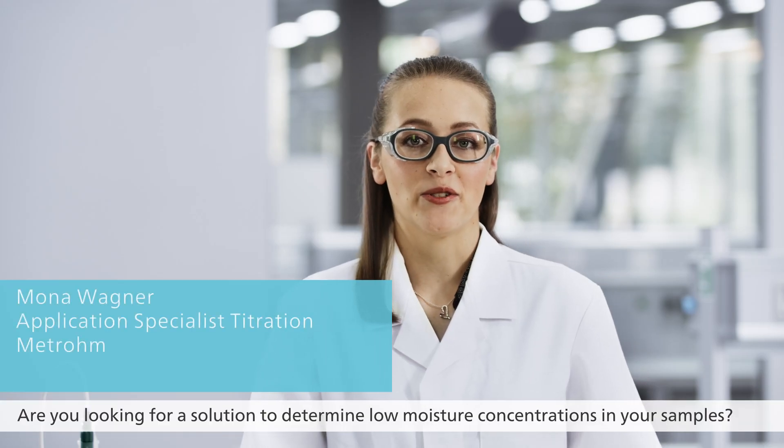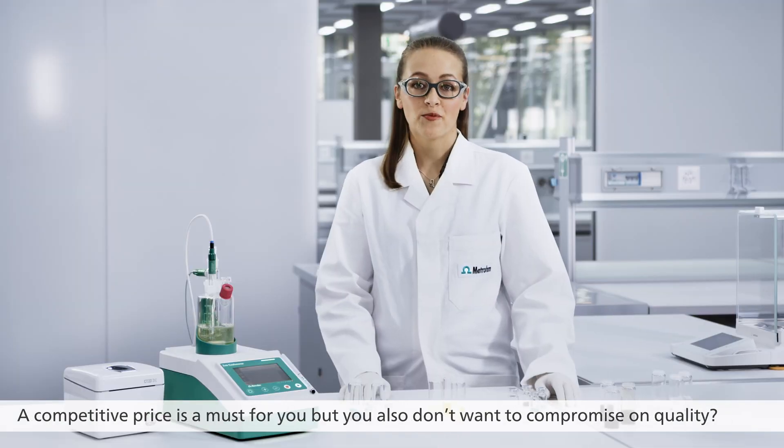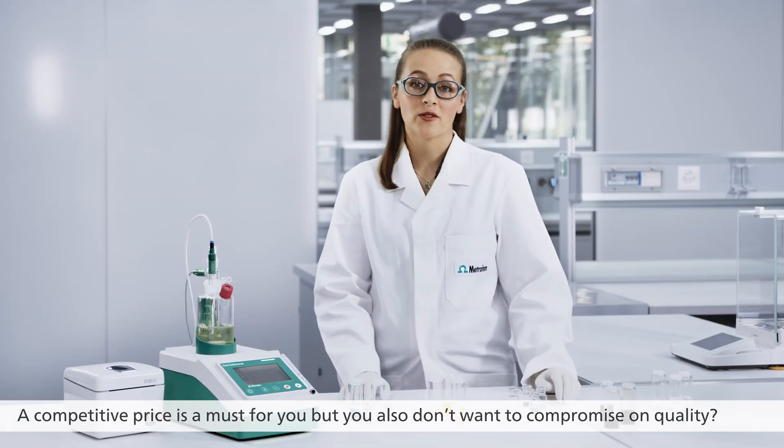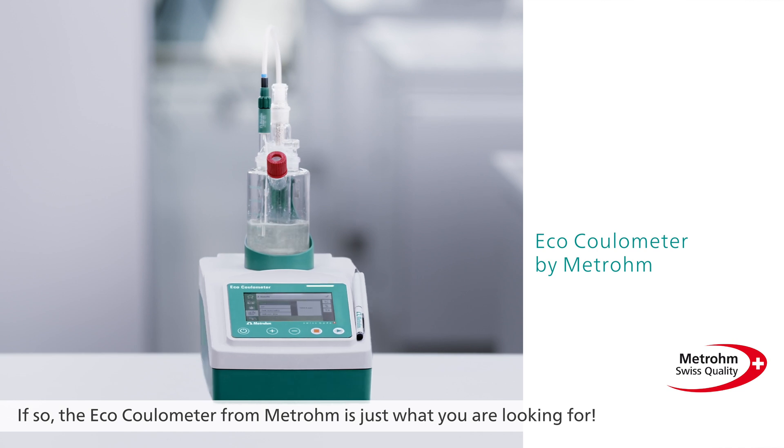Are you looking for a solution to determine low moisture concentrations in your samples? A competitive price is a must for you, but you also don't want to compromise on quality? If so, the Eco Coulometer from Metrohm is just what you are looking for.